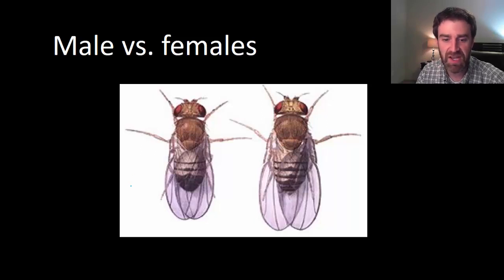For males, really the key thing you're looking for when you look at the flies is you want to look at their butts, or the back of their abdomen, really. If they have these dark, fully pigmented dark butts, then they're male. These are male flies. And if they have really light abdomens, you don't see that thick black pigmentation at all, then it's a female. And if you also see this striping pattern, it's a female.